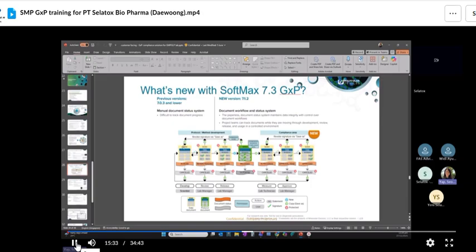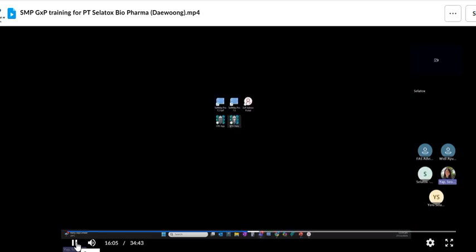So you see this SDAX, right? This is SoftMax Pro data file. X is GxP version. SPR, that is SoftMax Pro protocol file. So after release as a protocol file, the user from the compliance area or GxP, for example, a lab technician, can see this protocol file and use it to run routinely and ask the lab manager to approve.